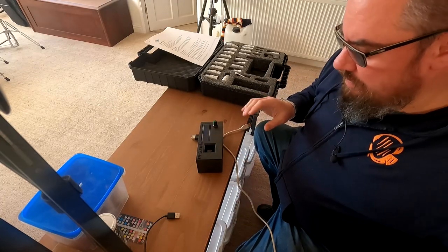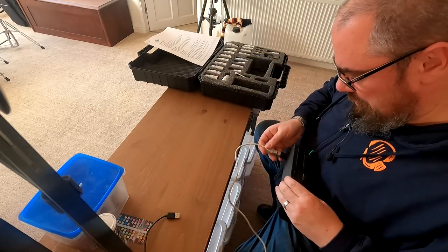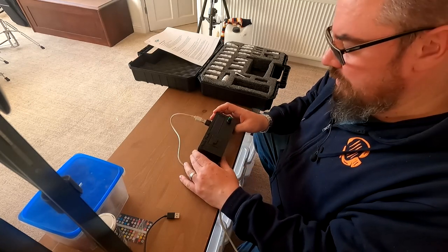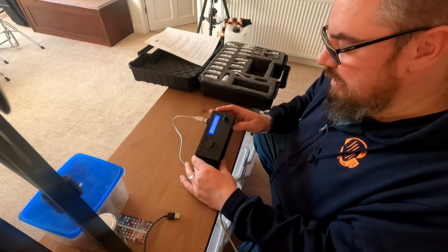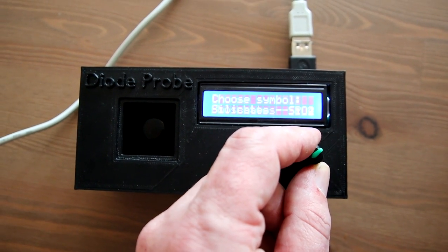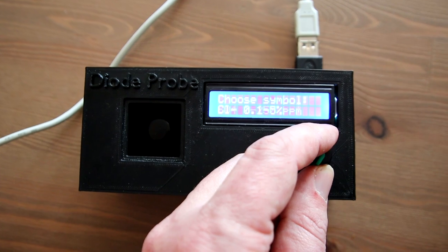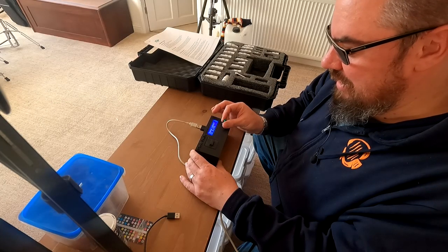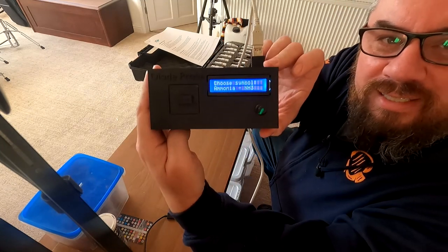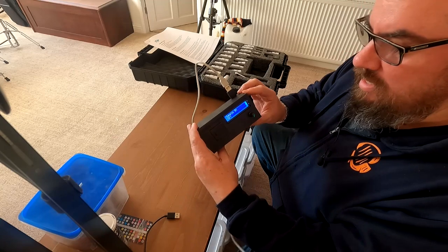The unit itself — we have the Diode Probe here. You just plug in a USB power source and the screen lights up. You're presented with a screen that says 'choose symbol.' It starts at pH, but you turn the wheel through copper, magnesium, iron, phosphate, silicates, nitrites, nitrates — going through all the options to select the test you want. Let's do ammonia, NH3.